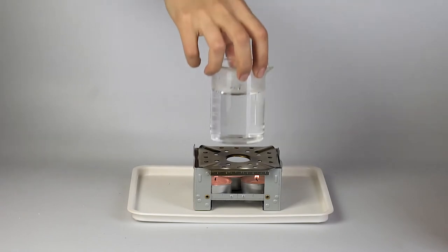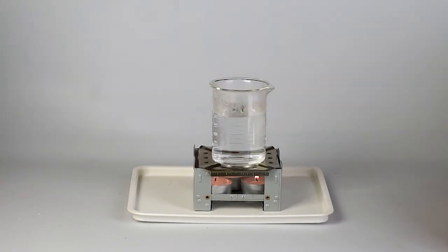Pour approximately 125 milliliters of boiling water into the beaker and put it onto the flame diffuser.